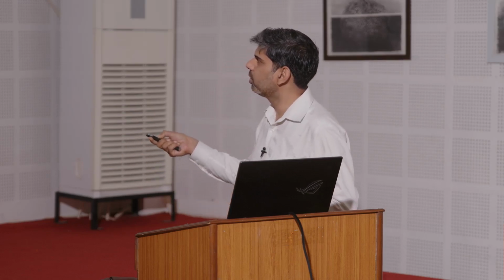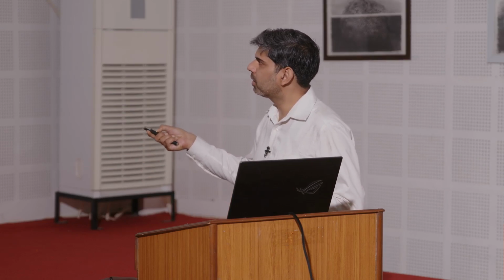So, just a quick introduction of microfluidics. Essentially, microfluidics is, you can say, plumbing on a small scale. What I have in my hand is a microfluidic device. This is made in glass and it has a network of microchannels. This is how a typical microfluidic device looks. There are channels made in this device and the device is bonded.